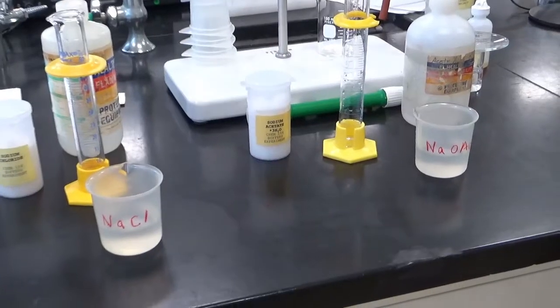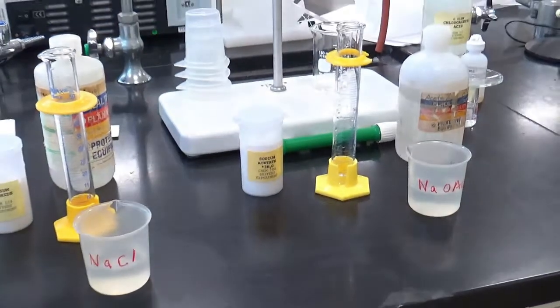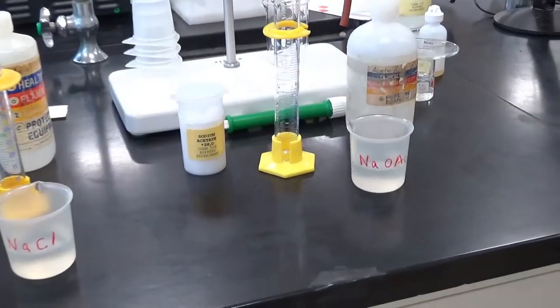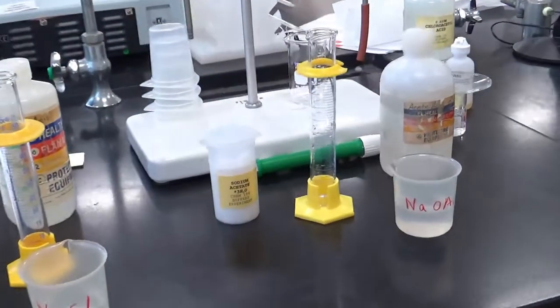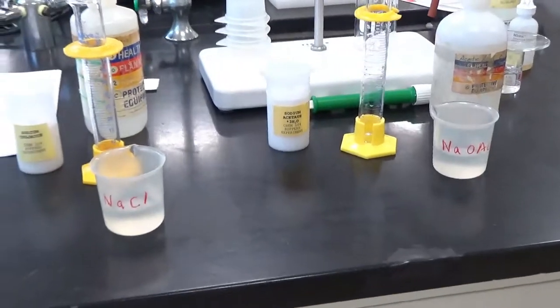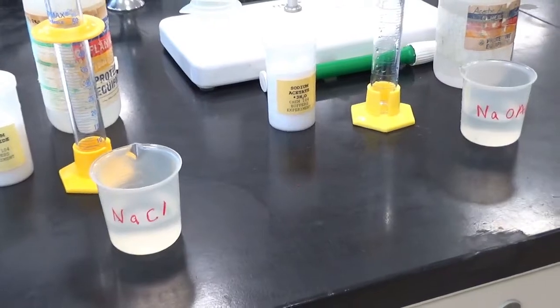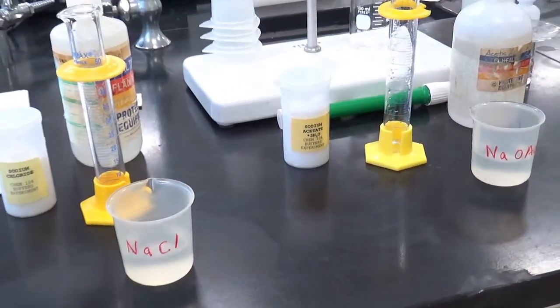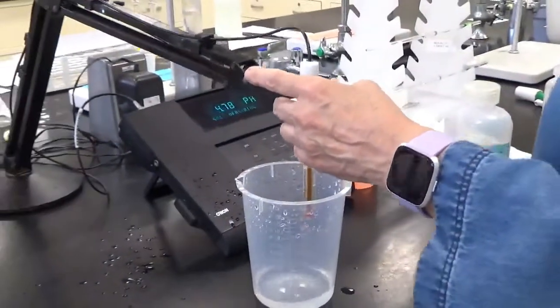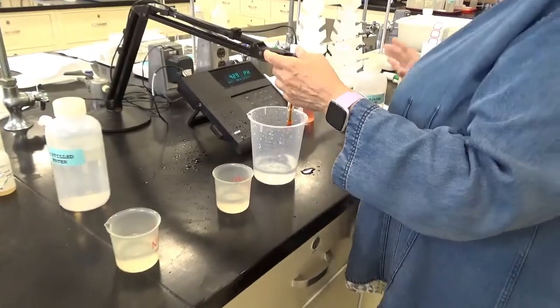Now we have our solutions. Sodium chloride is dissolved in the original 0.1 molar HCl solution, and the sodium acetate is dissolved in the original 0.1 molar acetic acid solution. Dr. Cooley is going to determine the pH of each of these beakers, and we're going to write that down as data. So she's going to rinse the electrode once more to make sure it's clean. I'm just rinsing off the pH electrode.